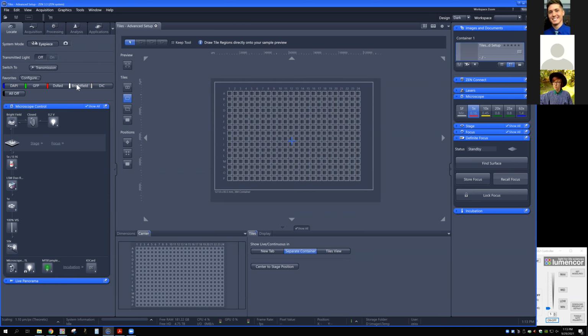Okay. It's on the right. We're at 5x right now, so I guess we can just focus on the edge of the chamber itself. Can you turn the light on? Yep. How's that? I'm on the 5x right now. I can switch to 10 as well if it's easier. You got it? It took a minute for it to come on. Okay, great.